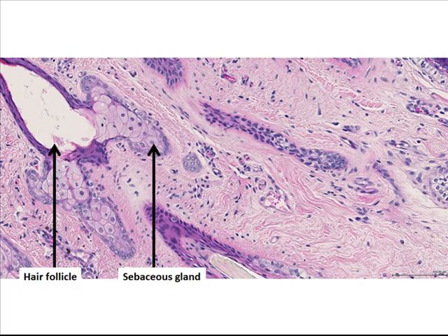In this case here, we're now looking at the skin from a sheep, and just for interest really, again we've got the hair follicle here in this sheep skin. This structure that's surrounding it, this is just a very nice picture of this. This is called a sebaceous gland, and sebaceous glands are normal structures that produce a substance called sebum. It helps to waterproof the coat and the hairs, and you can see nicely in this section that this sebaceous gland is emptying into this duct here so that it can then produce the sebum that gets onto the skin and helps give the animal a nice waterproof coat.